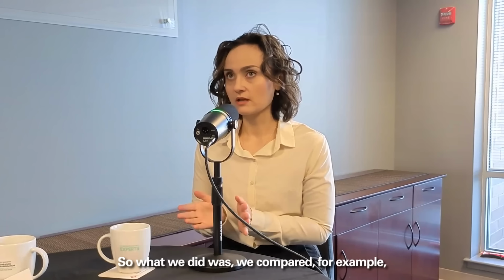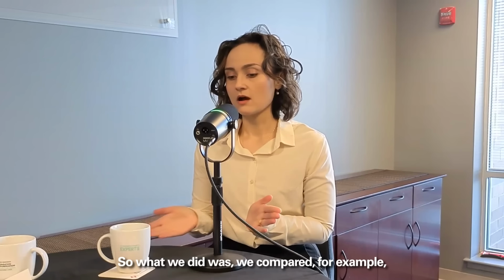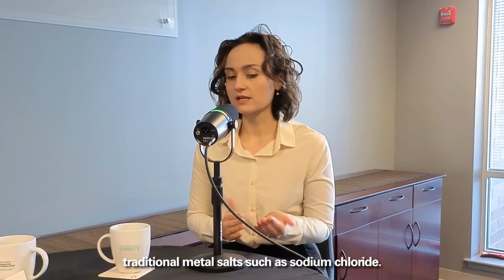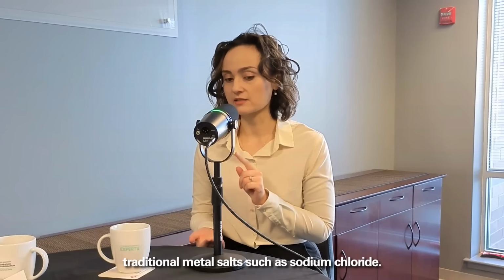So what we did was we compared, for example, the performance of choline chloride versus traditional metal salts such as sodium chloride. We saw over a twofold increase in resolution when you use choline chloride compared to an equimolar concentration of sodium chloride.